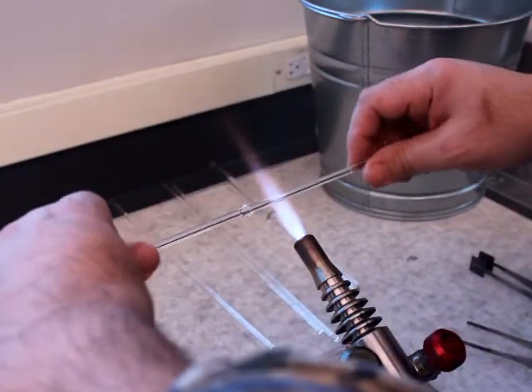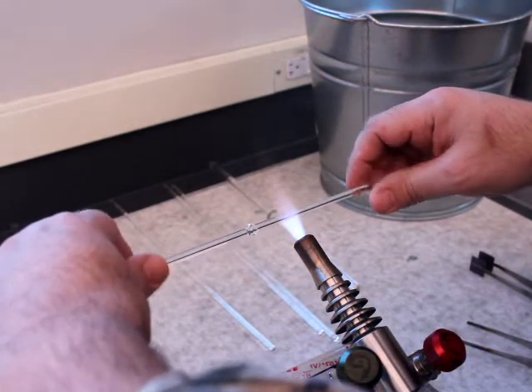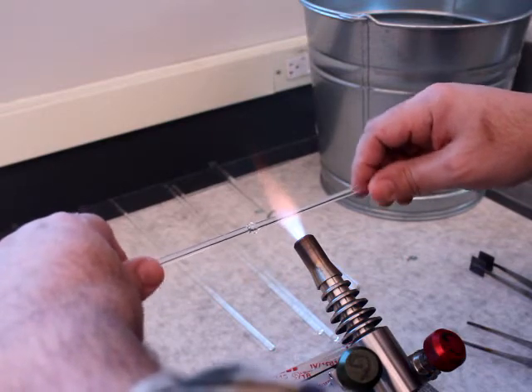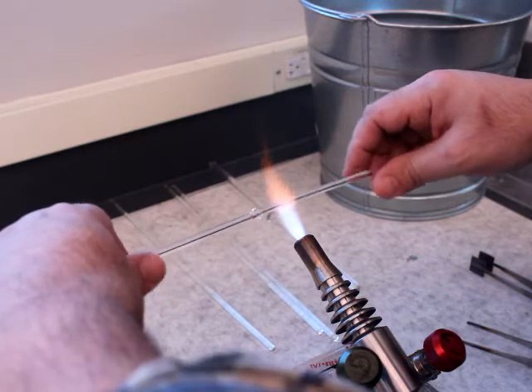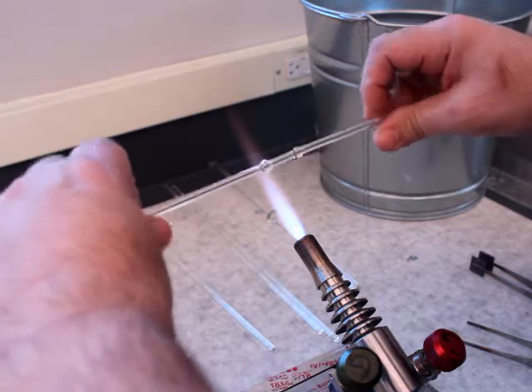Now approximately an inch to the right, I'm going to heat up another area of glass, go back and forth, heat this up. And then as I feel it softening, I come up, push, rotate, push, rotate.